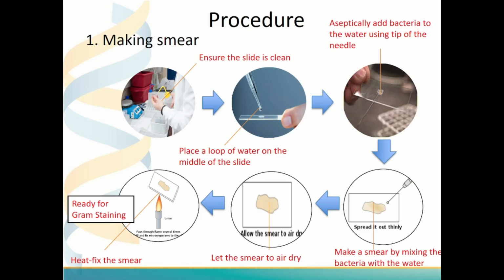Also, to hasten the process, the slide can be held high above a flame, not touching the flame, just high above a flame. However, there is also a risk that this process might disrupt the staining process of some gram-positive samples.